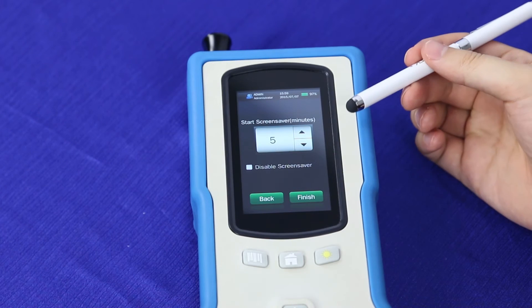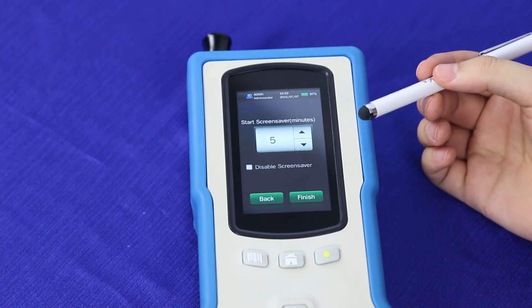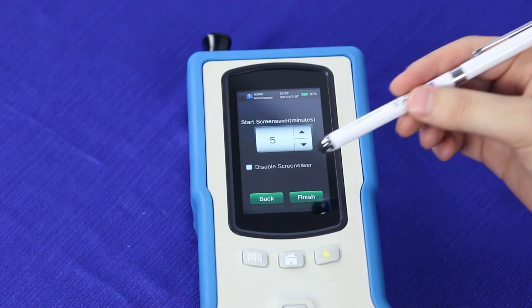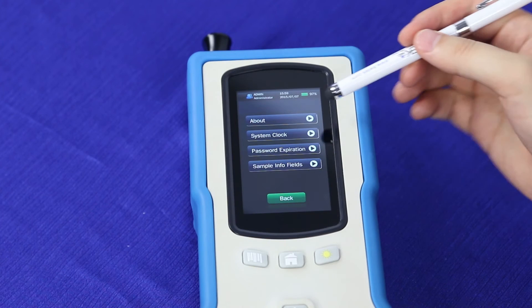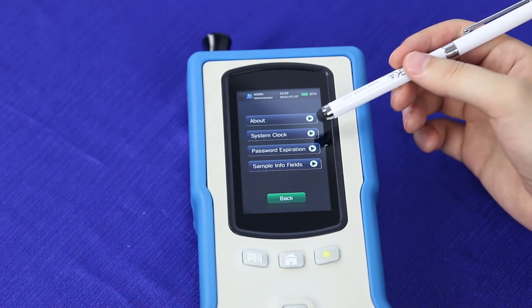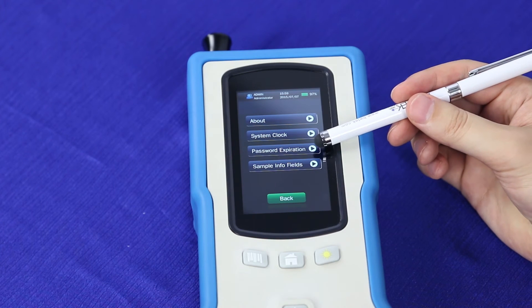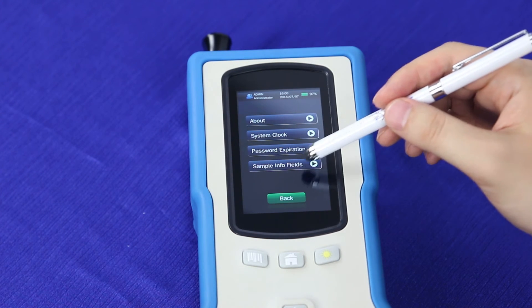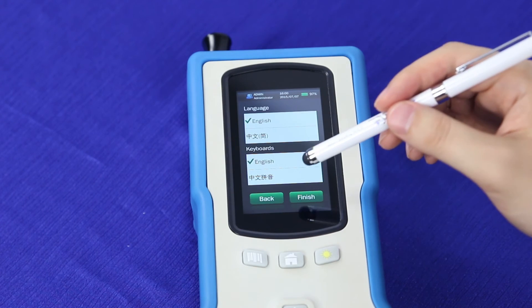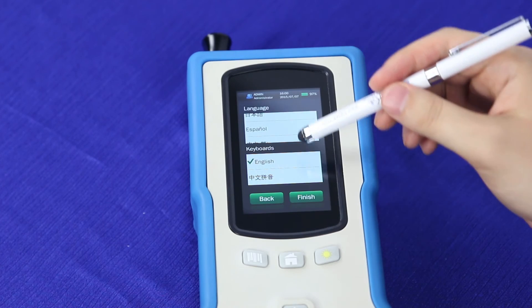You can also change your screensaver settings — make it longer or shorter, or disable it if you don't want it to go to a screensaver. There are also other general settings, such as setting your system clock, setting your password expiration time, adding fields to your methods, and changing different languages depending on your needs.